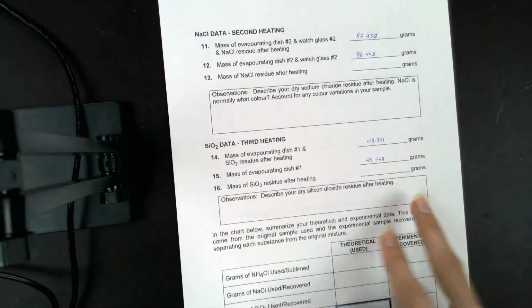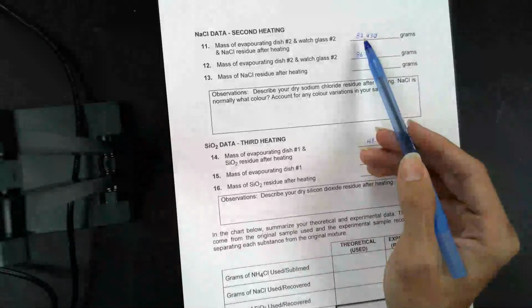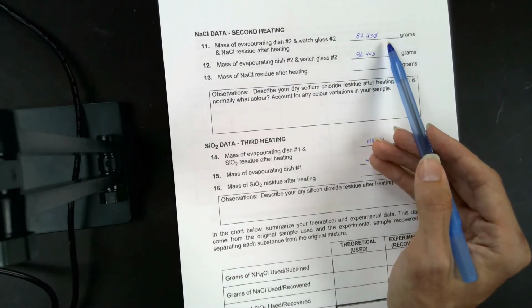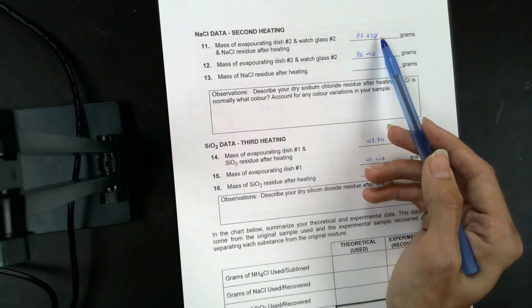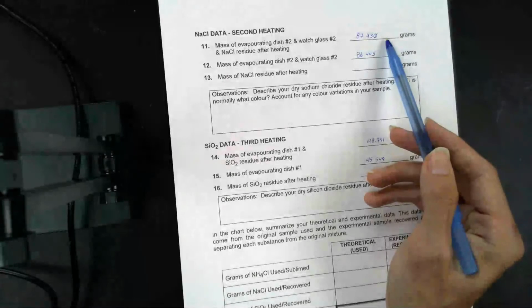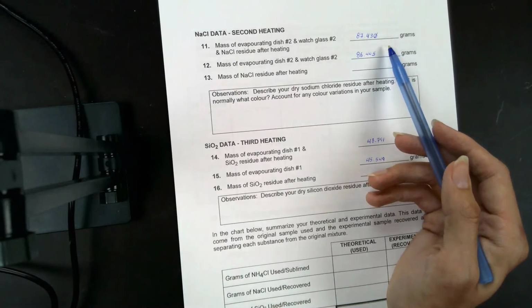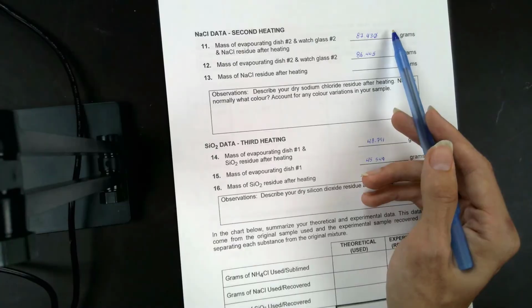Second page, item number 11. So if you'll remember, when I went through the second heating, I had two heating elements set up. I had a Bunsen burner on the left, and I had a hot plate on the right. Over the Bunsen burner was the salt solution, and it was in an evaporating dish, and it was covered with a watch glass. So item 11 is the mass of the evaporating dish and the watch glass and the salt crystals inside of it. Right? So I took my solution, I heated it with the watch glass over top of it, and then I weighed it once all the water was driven off.